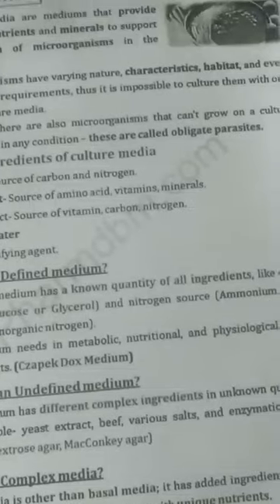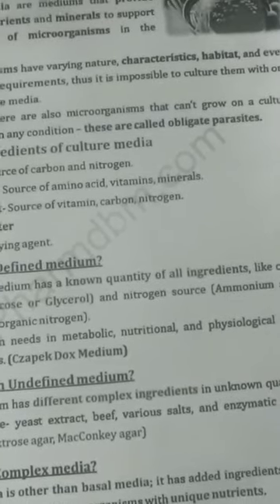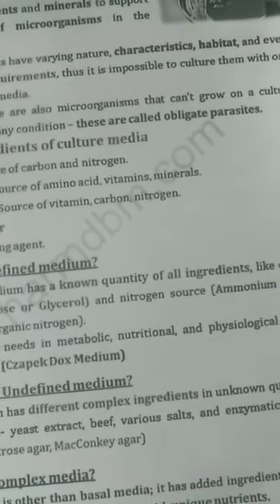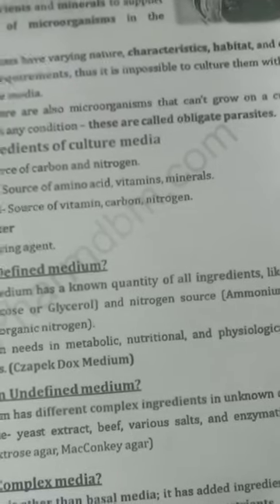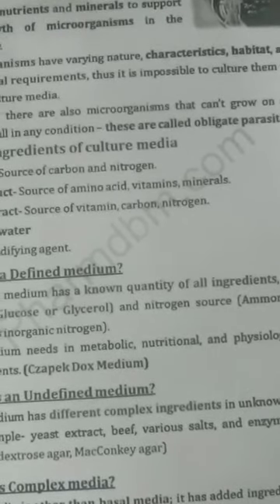Agar is an unbranched polysaccharide extracted from red algae species like Gelidium. Colony identification is done on this medium. Examples of solid media are nutrient agar medium, MacConkey agar medium, blood agar medium, chocolate agar medium. Growth of bacteria on solid medium appears as smooth, rough, mucoid, round, irregular, filamentous and punctiform.